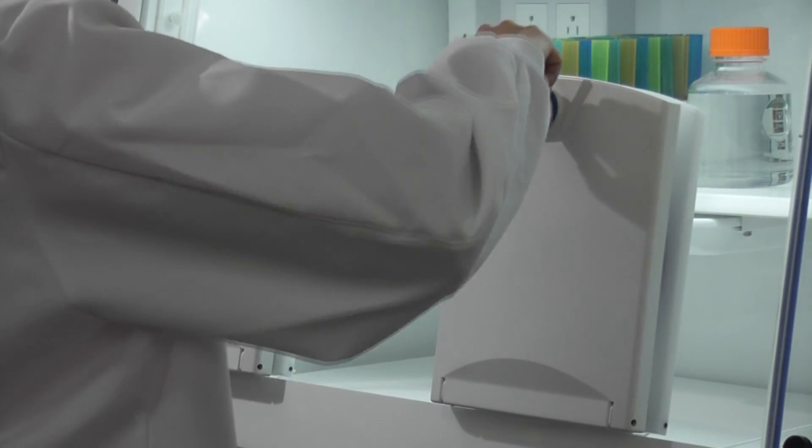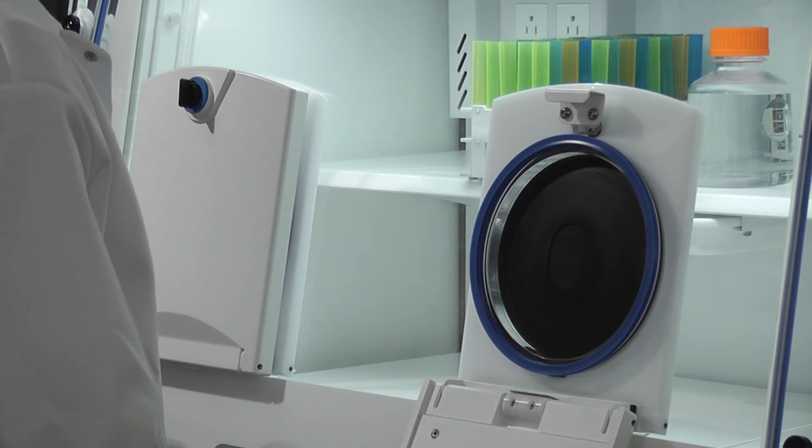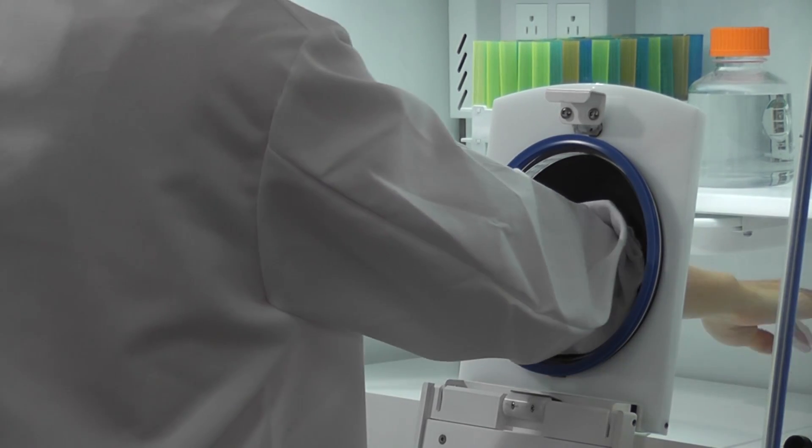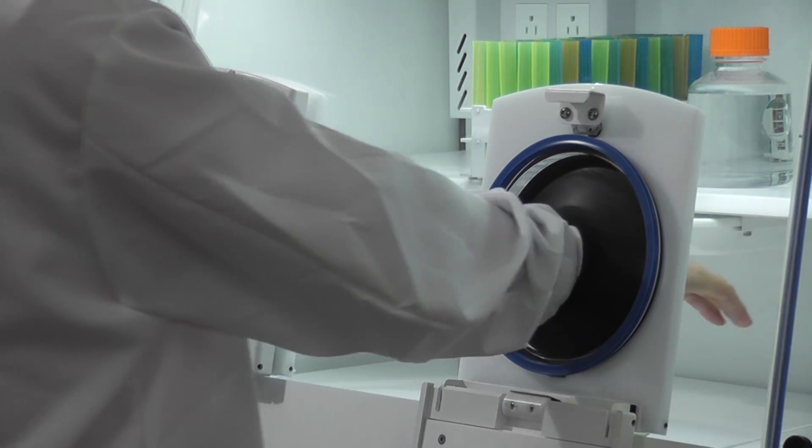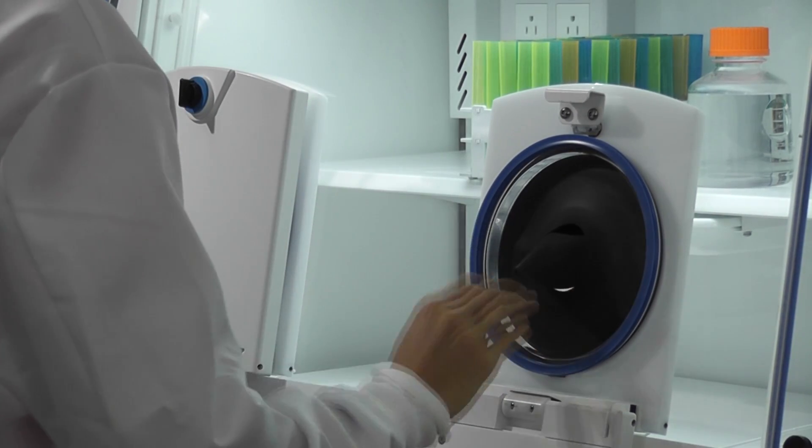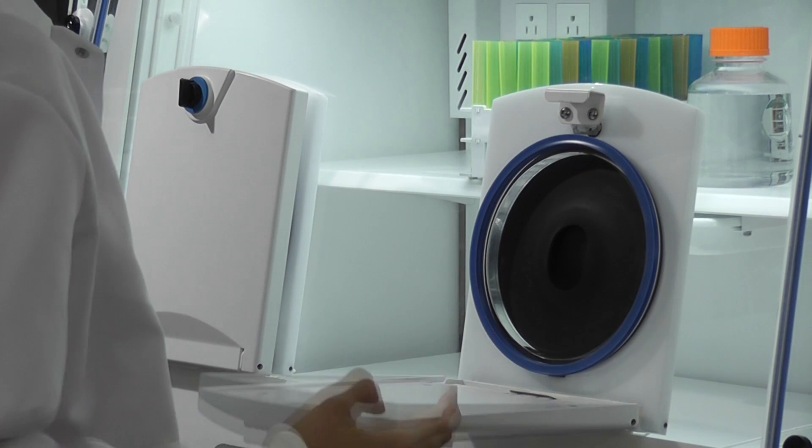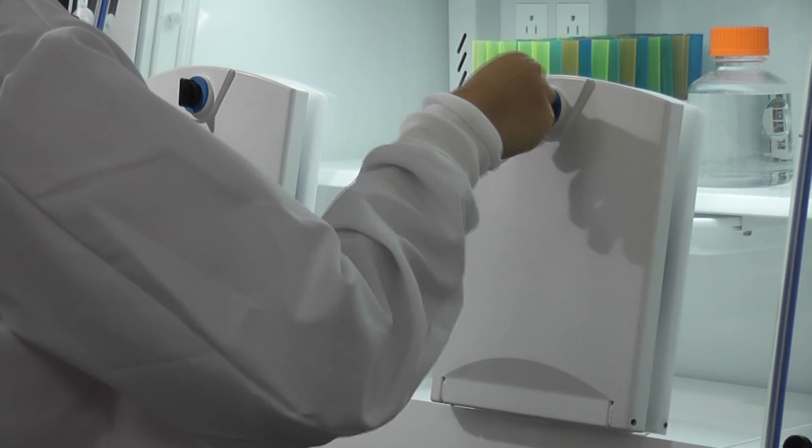To gain access to the workstation, open the outer door. Insert your hand and begin working. When finished, withdraw your arm slowly. Tuck in the flap and close the door. It's that easy.